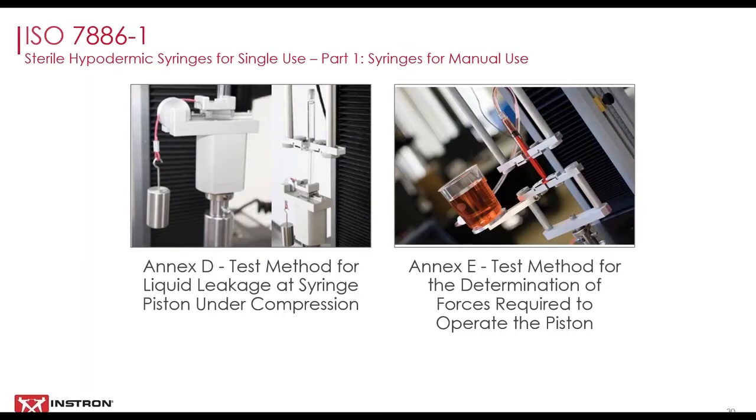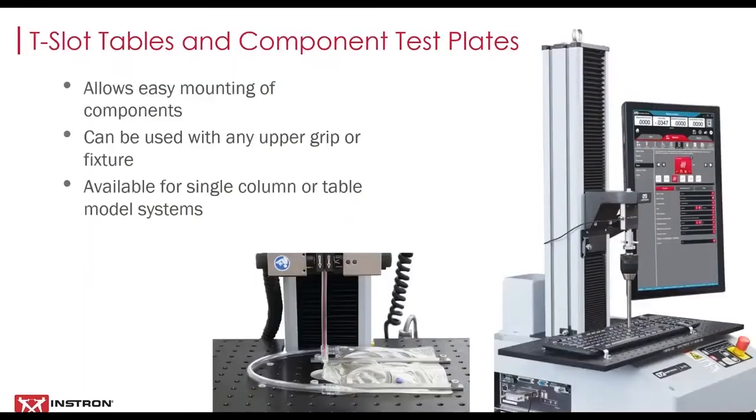Annex E specifies a test method for quantifying the forces needed to activate the syringe plunger. This test is used to evaluate the force profile associated with expelling liquid from the syringe barrel. Instron's fixture is fully adjustable for use with multiple syringe sizes.